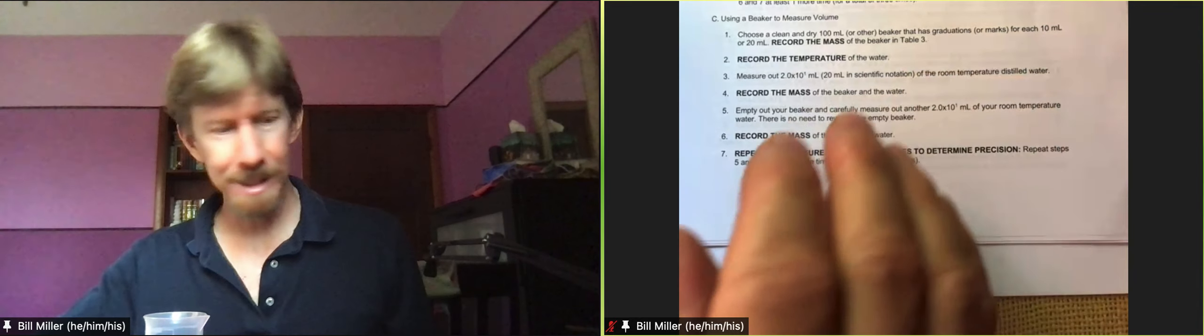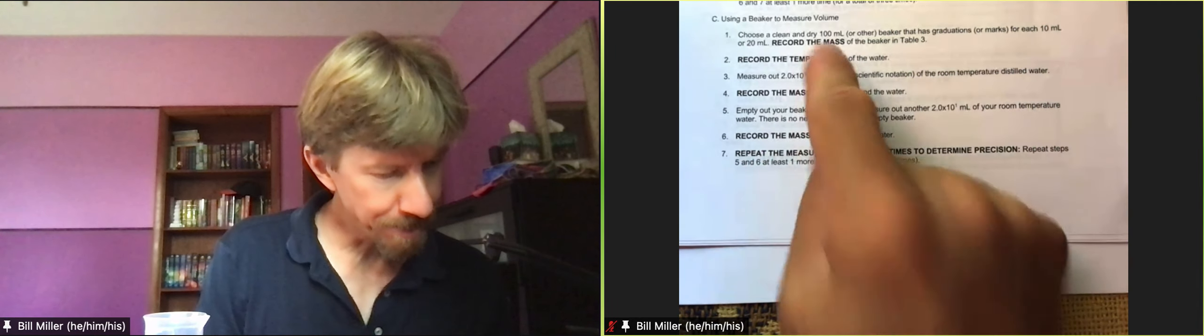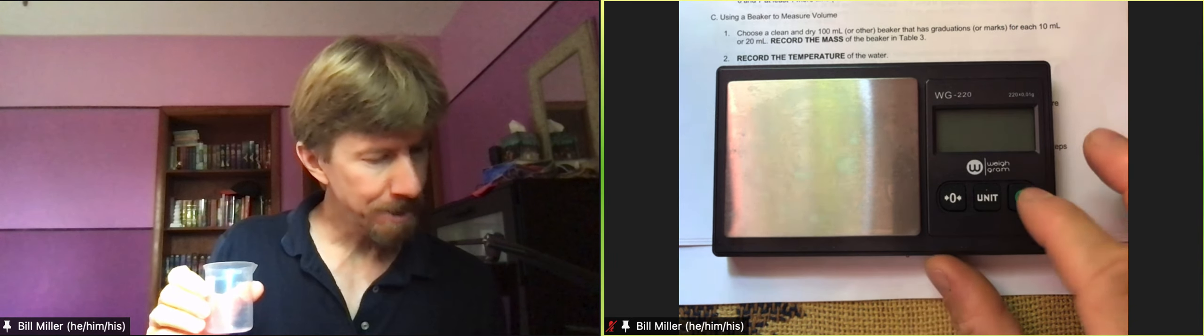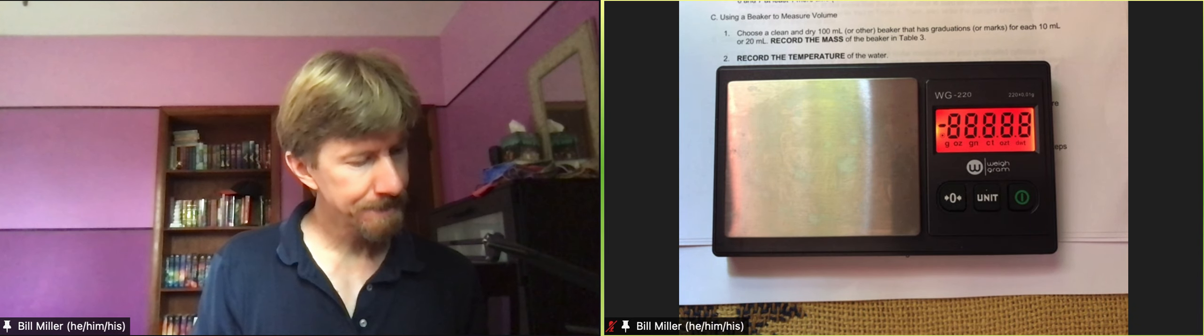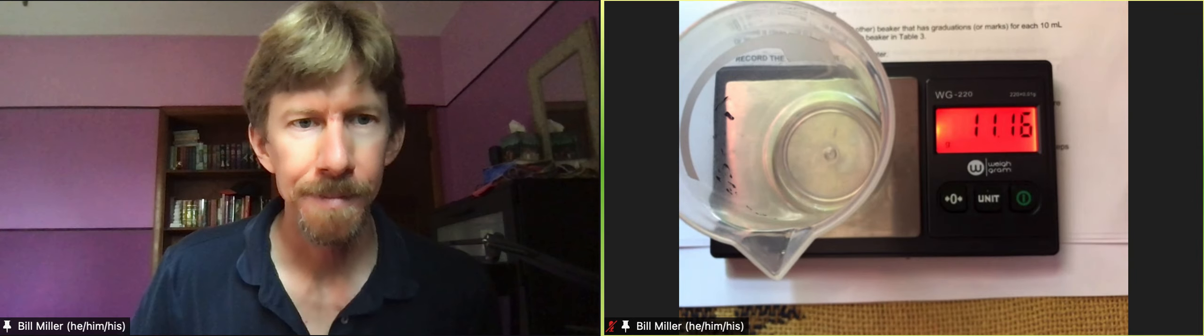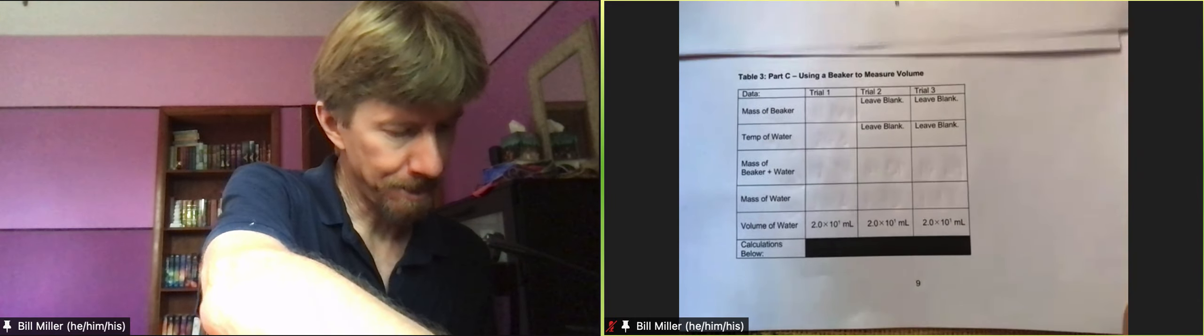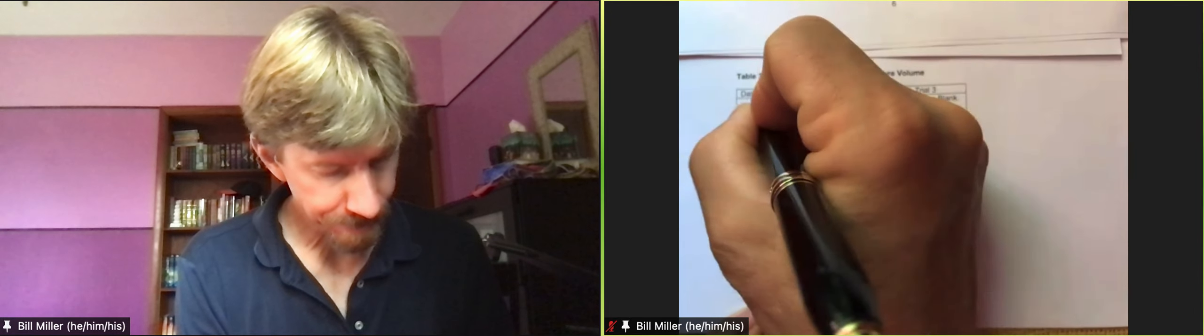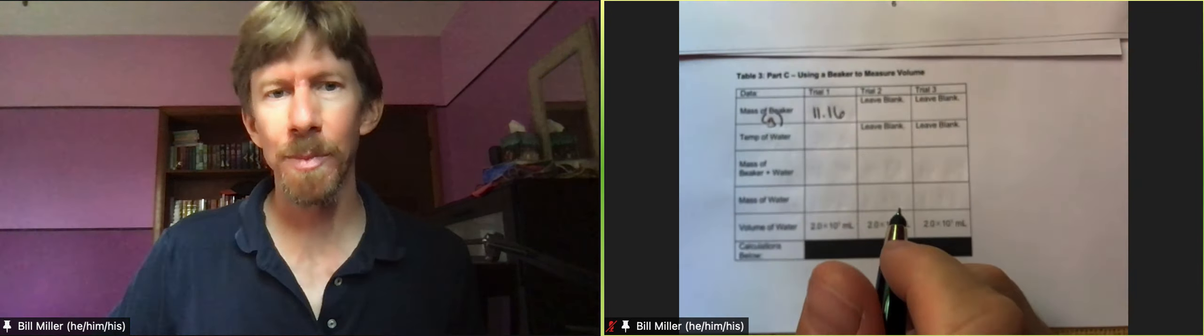Let me get my scale. Record the mass. And I looked at it, and my markings are every 10 milliliters, just like it says. Record the mass. There's my circle. 11.16. I think that's the same as the previous one. Good. That means it's clean and dry. That's a useful check. And that's 11.16 grams.